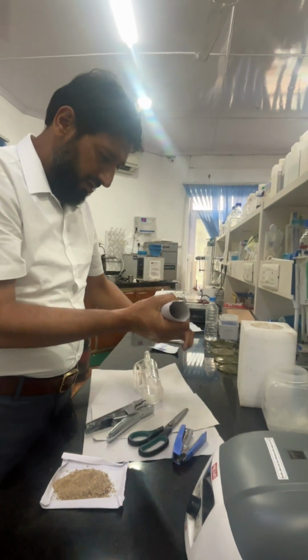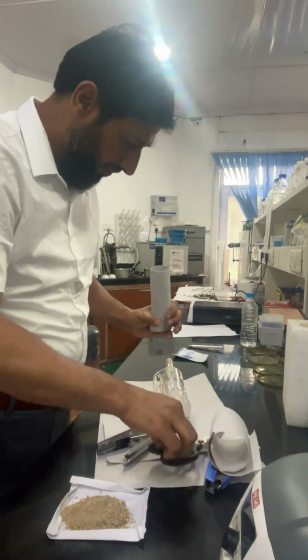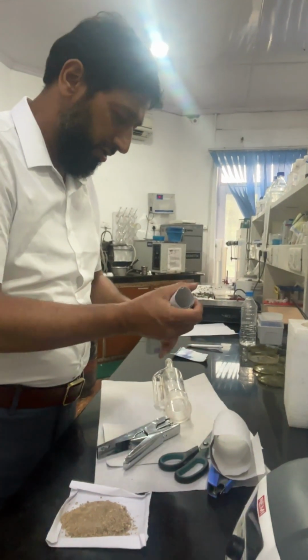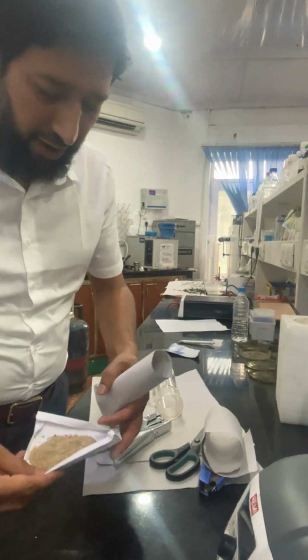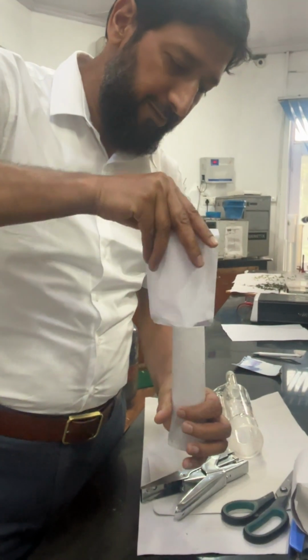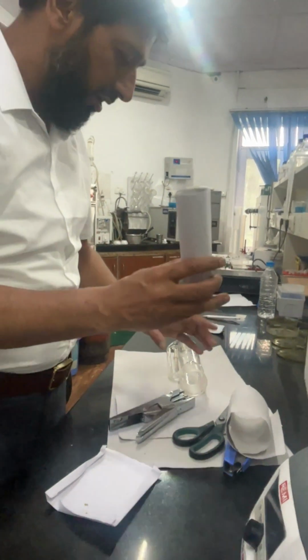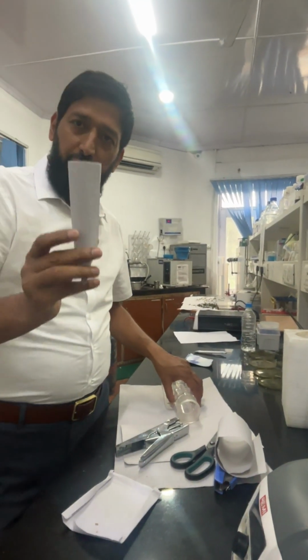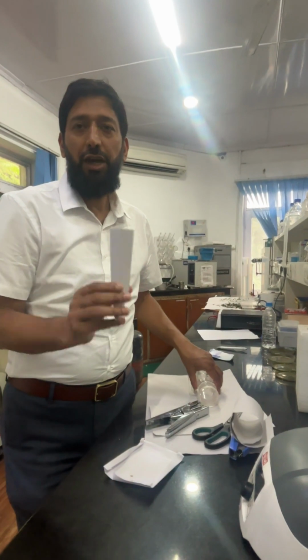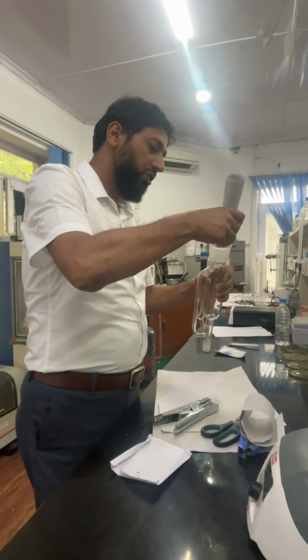I'll cut it here. Cotton. And I'll put, this is 25 grams of the sample, plant extract. It should not be filled up. We should know the weight of the plant that we are taking, because later if we get the compound X at the later stages, we know how many grams of this produced X grams or X milligrams of our compound. So I'll not put it first.